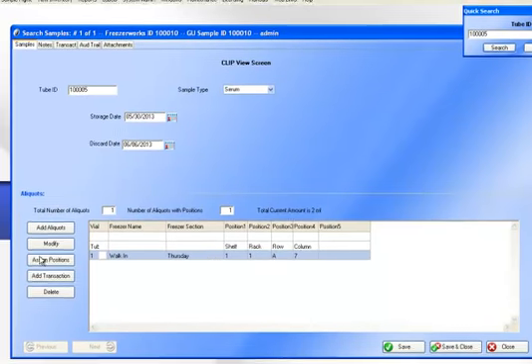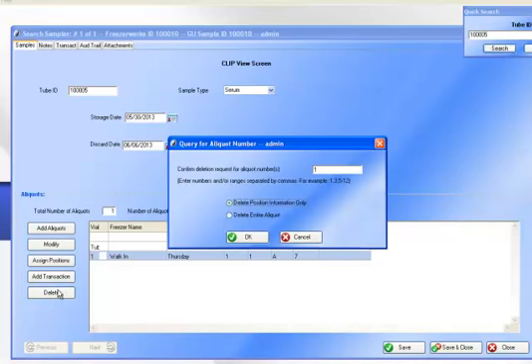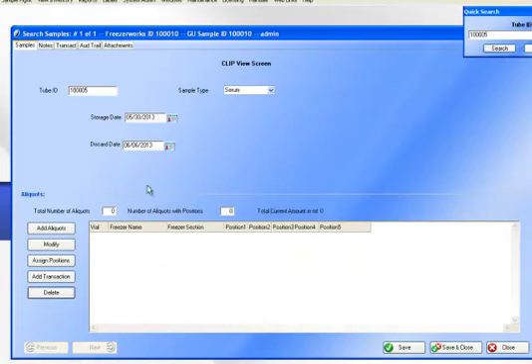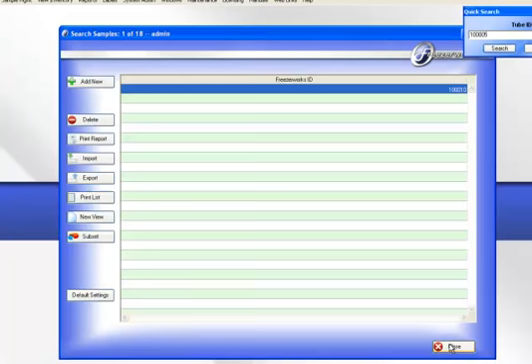I may want to go ahead and delete that aliquot here when I'm done. So I pulled it out, delete it. I'm going to delete the entire aliquot. When it's tested, it's gone. I remove it. And so aliquot number 1 is now gone because I deleted it. And I run my test. Found it quickly, used it, and everything.